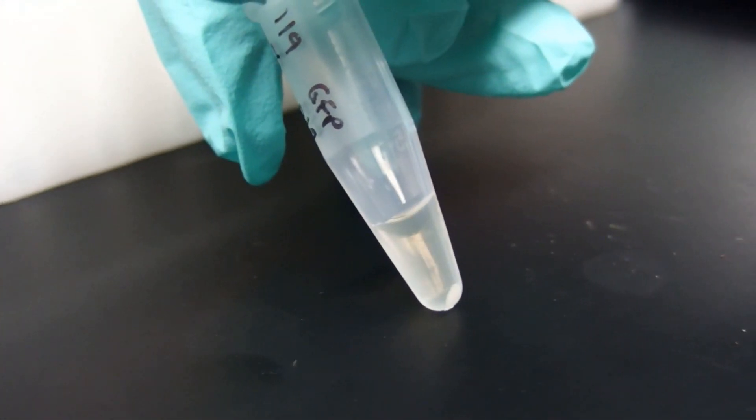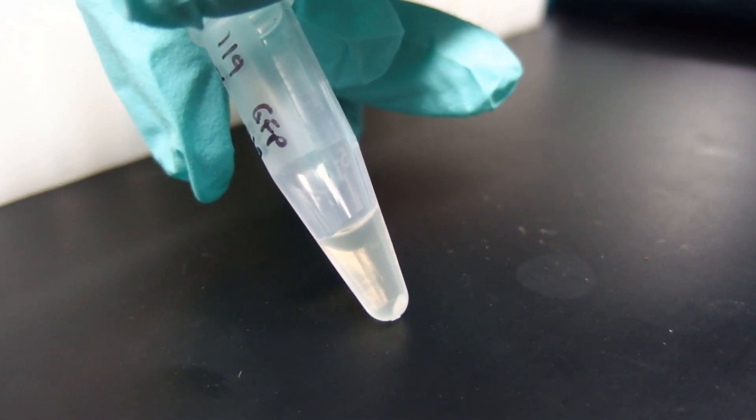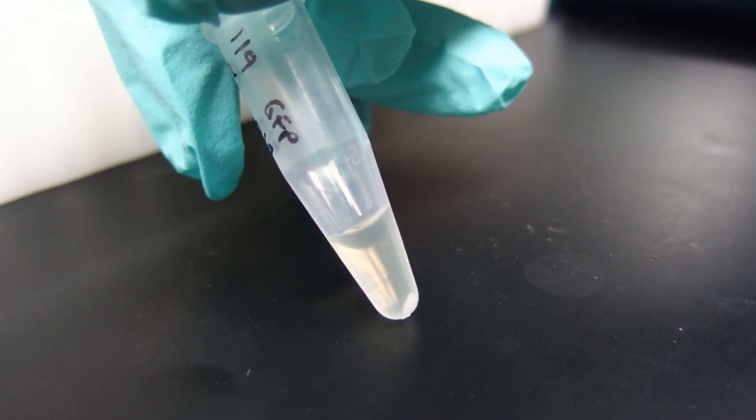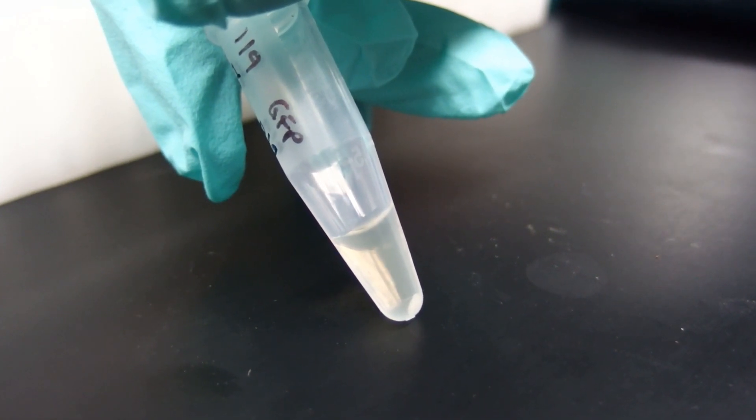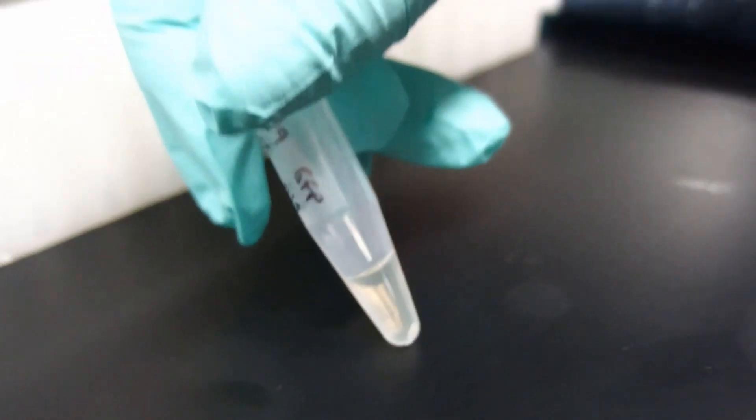You can see the bacteria is pelleted at the bottom. What we are going to do now is take the supernatant out and then we are going to transfer the activation buffer into this bacteria.